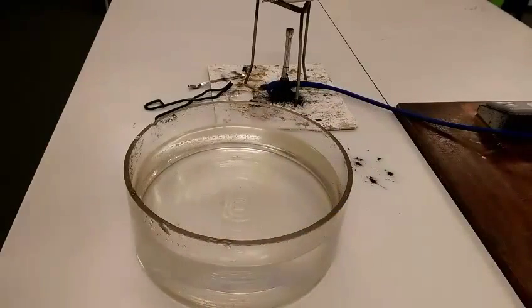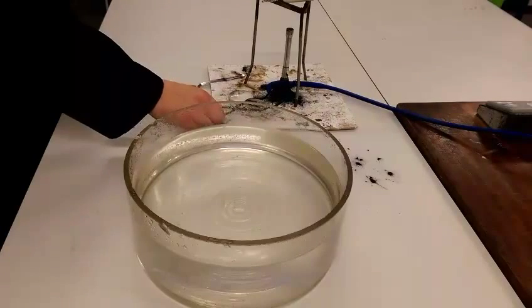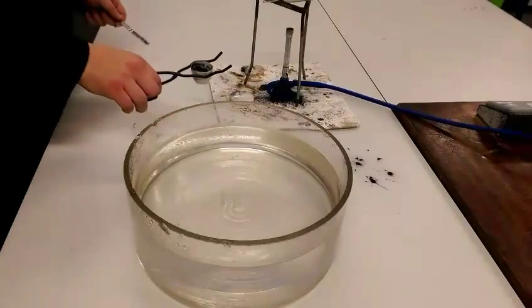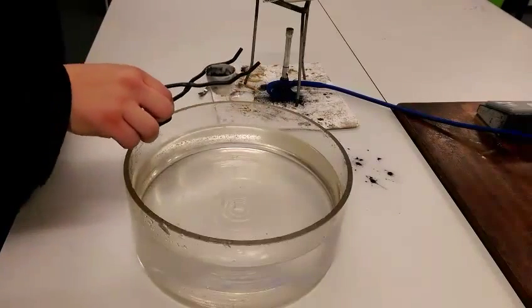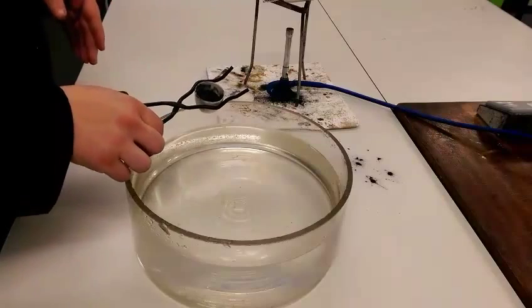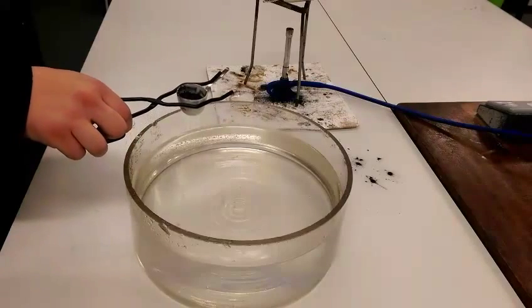Now I've finished heating my copper oxide and carbon. The carbon will have reacted with the copper, and because the carbon is more reactive than the copper, it will have removed all of the oxygen to form carbon dioxide. If I can tip this up into the water here, we should see any metal that's produced will fall to the bottom, and any unreacted stuff like any leftover carbon or copper oxide will float on the top.